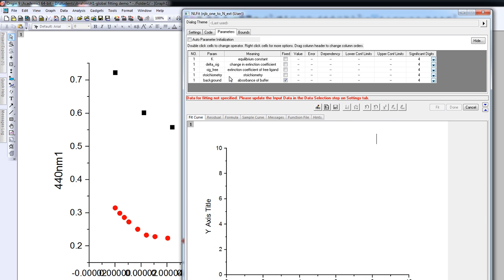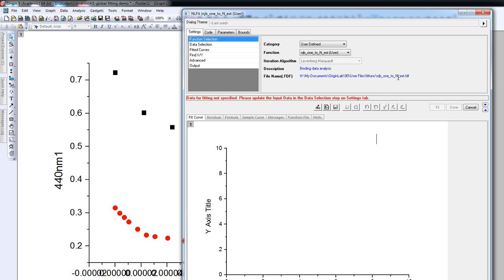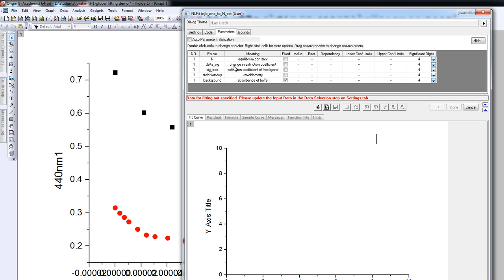We're going to have a look at the parameters. What we see here is that we have an equilibrium constant, a change in the signal, the signal for the free ligand, the stoichiometry for the interaction, and the background — basically the absorbance of the buffer. We can also see whether parameters are fixed or not, and the number of significant decimal places for the results. We'll go back here later.